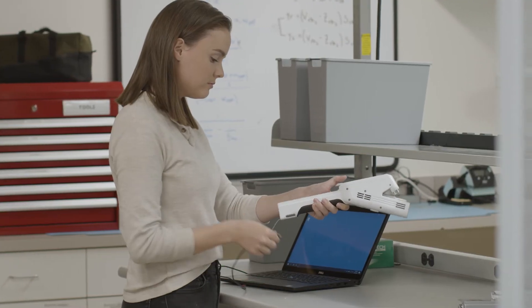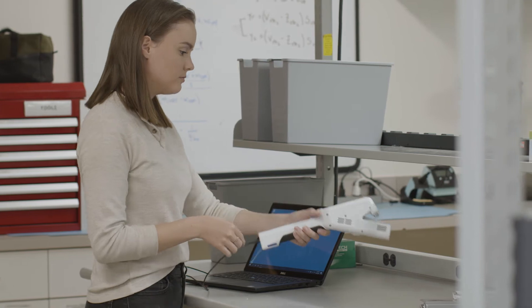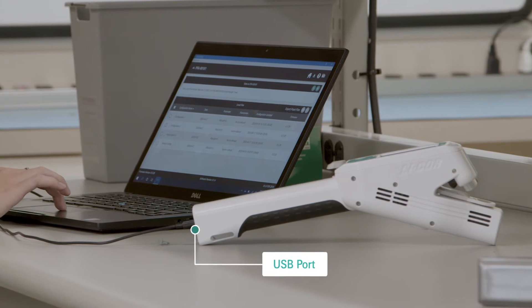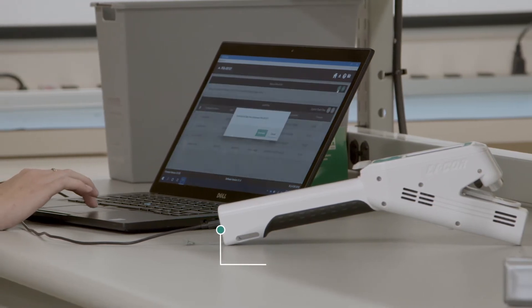When you're ready to stream data from your device, just open the user interface. Working with students or need to share your results with the group? Stream live data with the LI600 using its USB port.